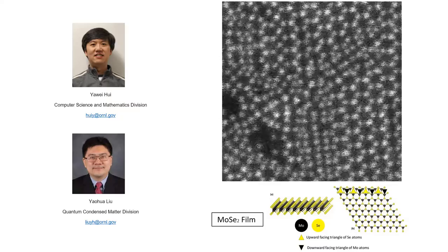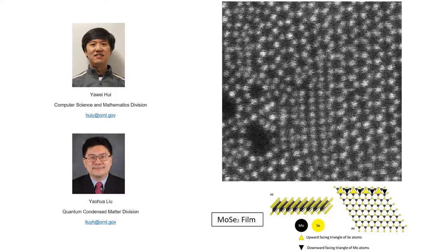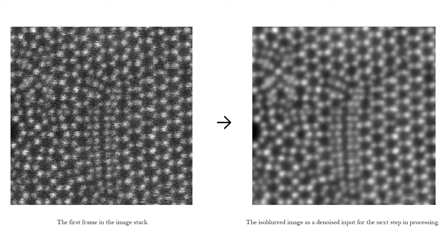In the first task, we used the classic blob detection algorithm in computer vision to locate the atom centers in each frame. In order to increase the accuracy of the detection algorithm, we pre-treated the images with isotropic blurring. We have noticed, however, other denoising processes such as image ptychography could be applied in this situation to better the final outputs.